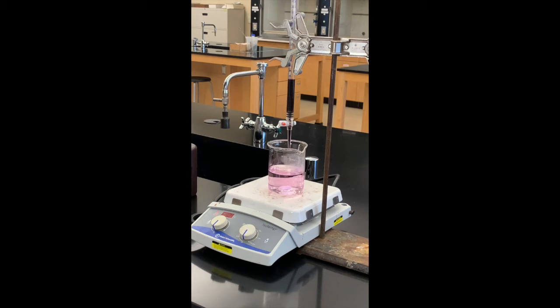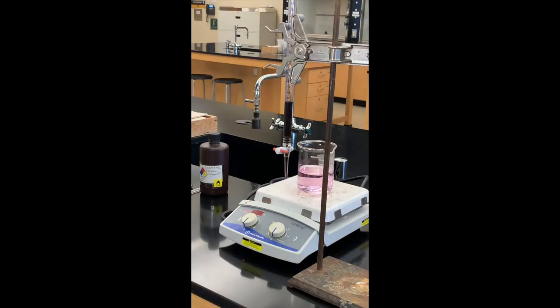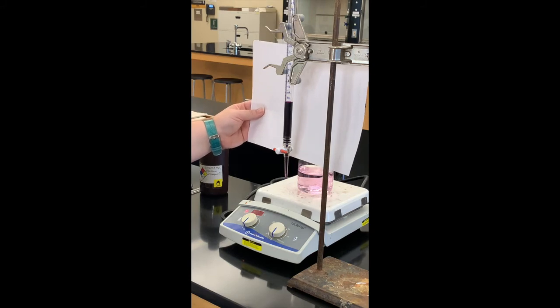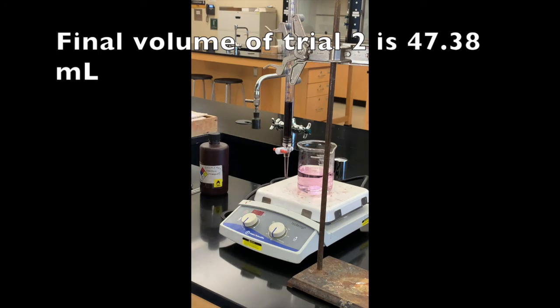Between the second and third trials we will need to refill our burette, so when I come back it will be refilled and our third trial will be ready to titrate. The final volume for trial two is 47.38 milliliters.